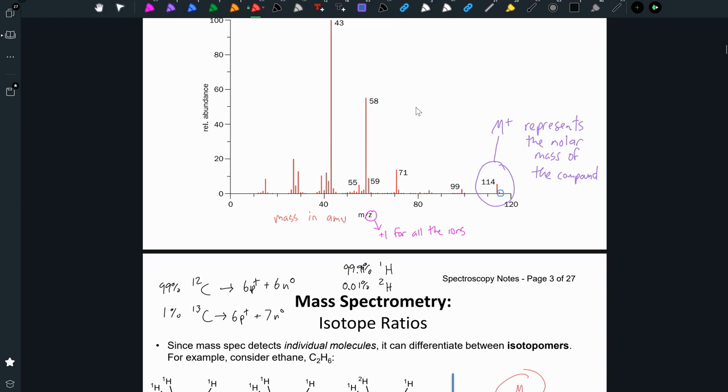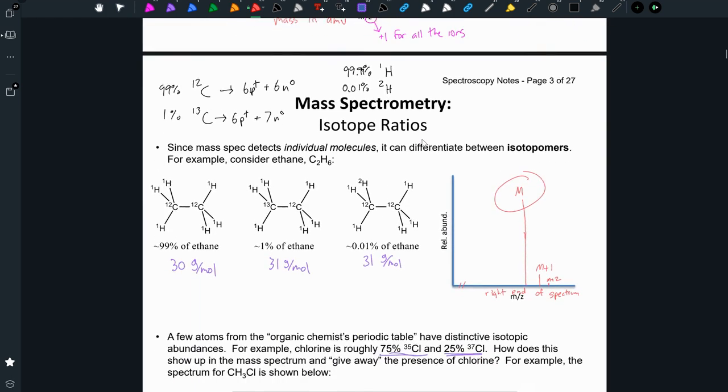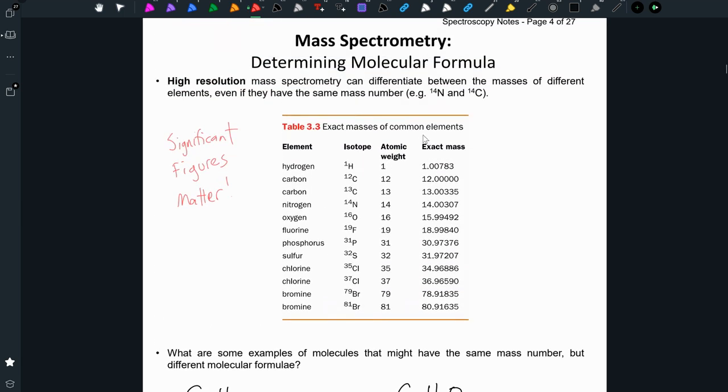body of research around how molecules fragment, and so the different fragments can give an experienced chemist more information. But the bottom line is, in the end, what we can do is come up with the chemical formula for our compound by using this technique.